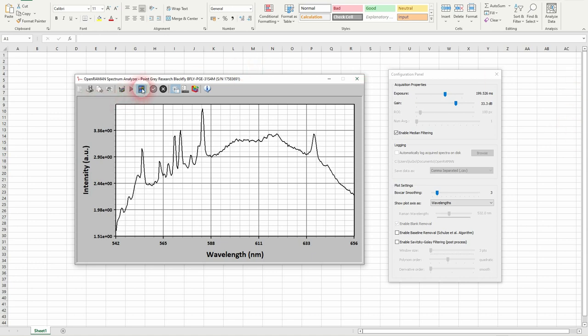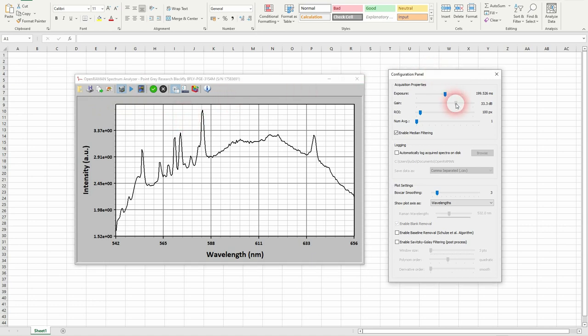So what I will do is I will switch off this one. I will put the gain to zero and I will set the default value of about one second.